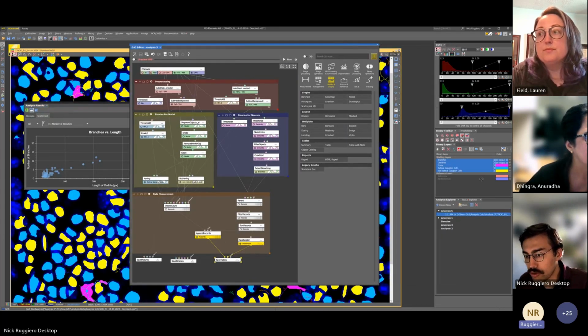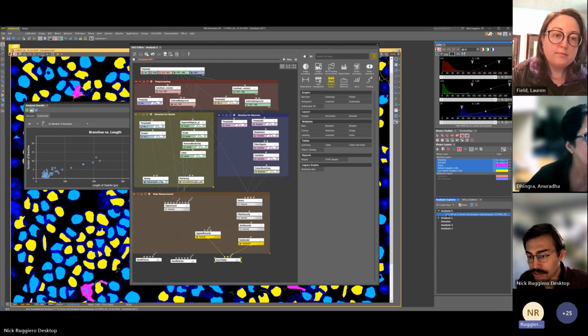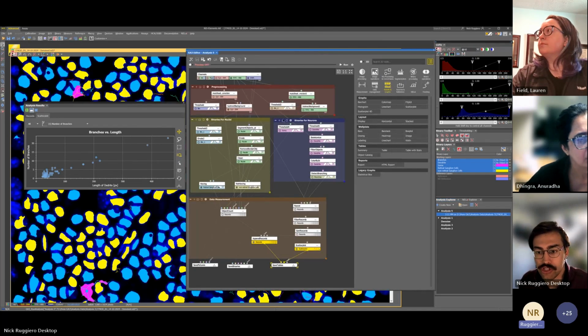And the other thing you'll notice down here is we got a little arrow on our analysis. It'll say that at 3:11 p.m., which is right now, we ran this analysis on this file. As you run more GA3s, this is where all the analysis runs for all your GA3s will live. So this is where this is sort of going to be. And we can talk more about this layout if you guys have questions later. But I think for the purpose of getting through this, this should be pretty good.